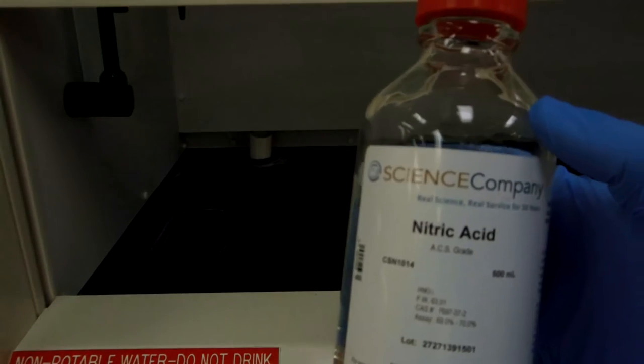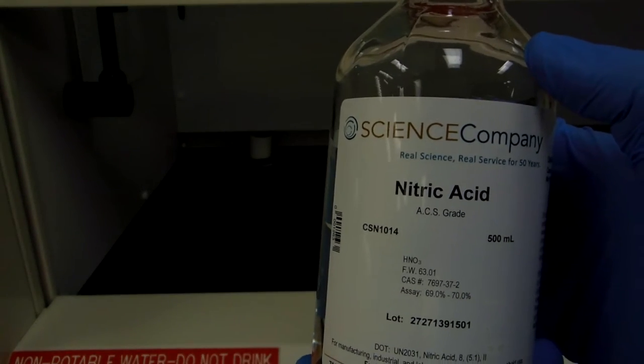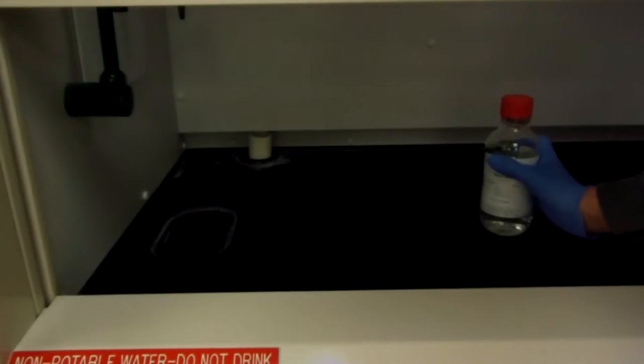Now here is some of the nitric acid I have bought. It is 500 milliliters in volume. Always handle acid containers with gloves, in this case nitrile gloves. And here is a bottle of nitric acid in a jar, which I will get right now.